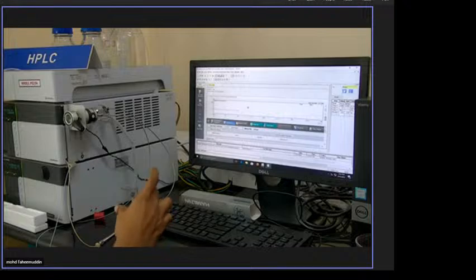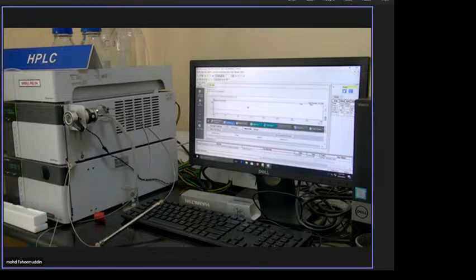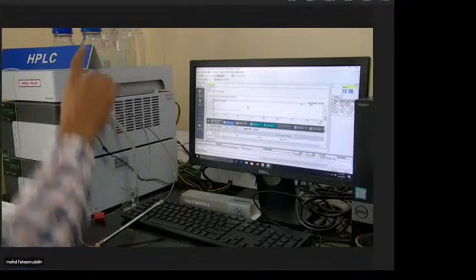Okay, the same thing, the principle is like the dilution. The carryover is different. Carry just before me a sample, our sample effect will be on the column. So then we have to do the minimum time of washout period with polar solvent and non-polar solvent.